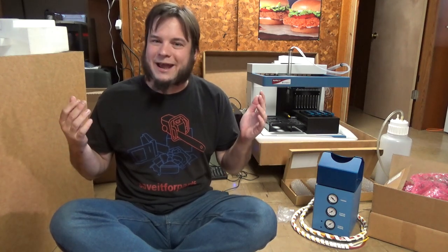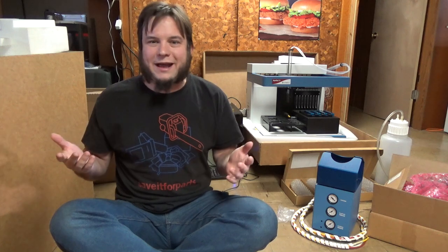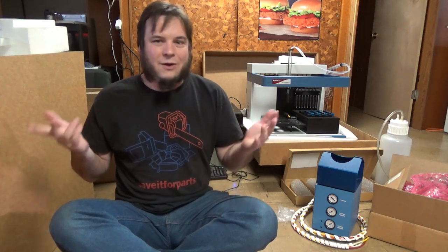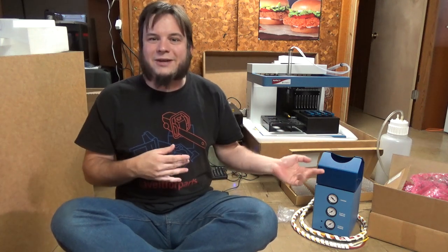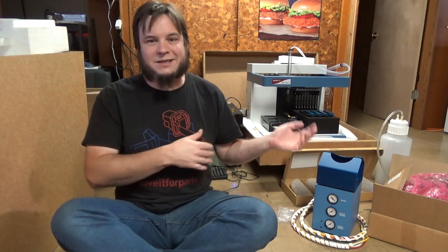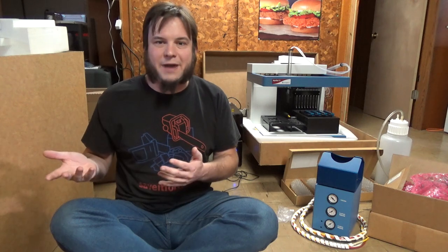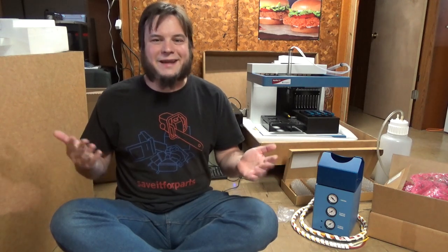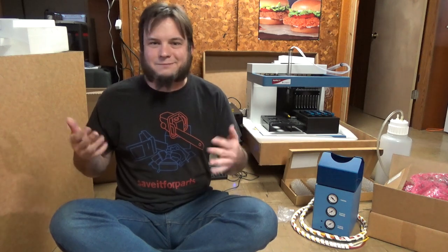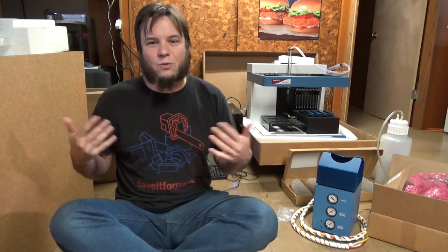I think before we do any bioscience with this, we're going to have to consult some experts. We're going to have to find out what can you actually do with this? How do you actually do it? What do you need? It seems like there's some extra chemicals and parts involved, maybe some precursor steps, maybe some afterwards steps. Obviously, that's going to take more time to figure out. We're not going to do all that in this video. I wanted to just get this thing out of the box, see what we had, see what we're missing, and then from there, maybe we can figure out what things we need to do anything useful with this.